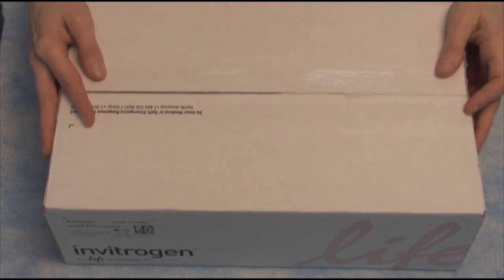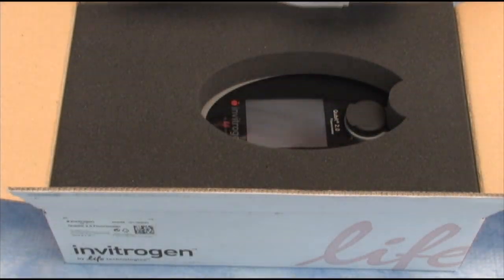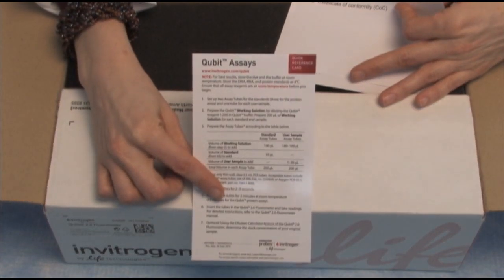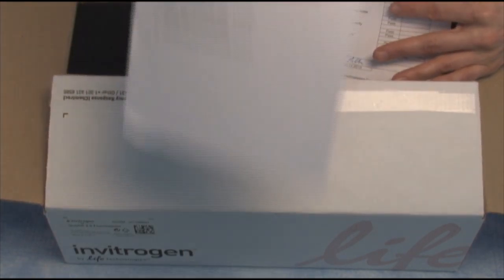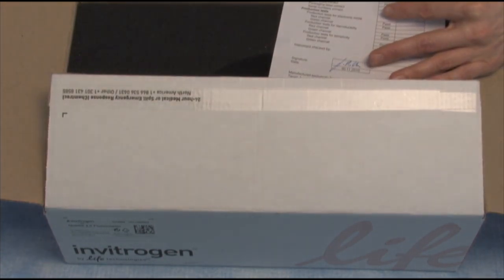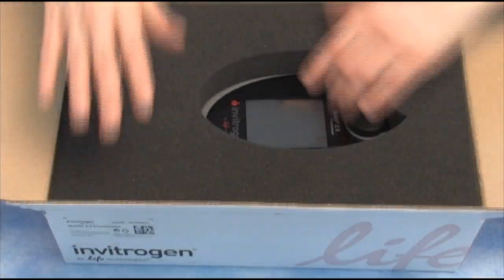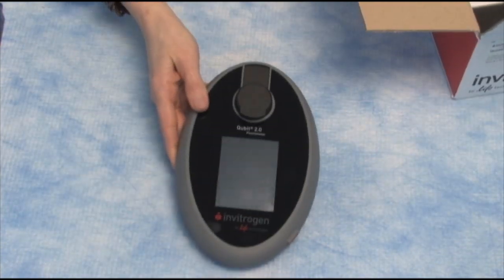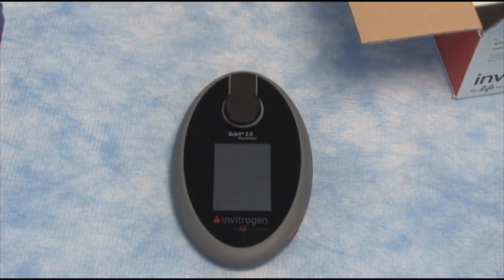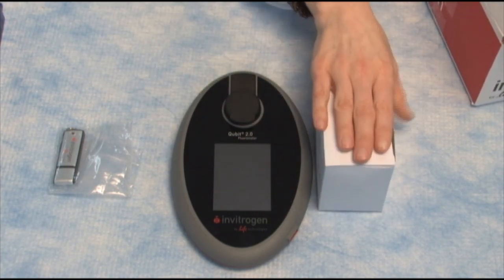In this box I have the Qubit 2.0 fluorimeter. Let's open it up. We have three pieces of paper: a quick reference card so that we understand how to do the Qubit assays, the packing slip, and a certificate of conformity. Now let's get down to the Qubit. We'll take off the foam, take out the Qubit, and set it down. Our USB drive we'll keep here, and this box here has our power supply.